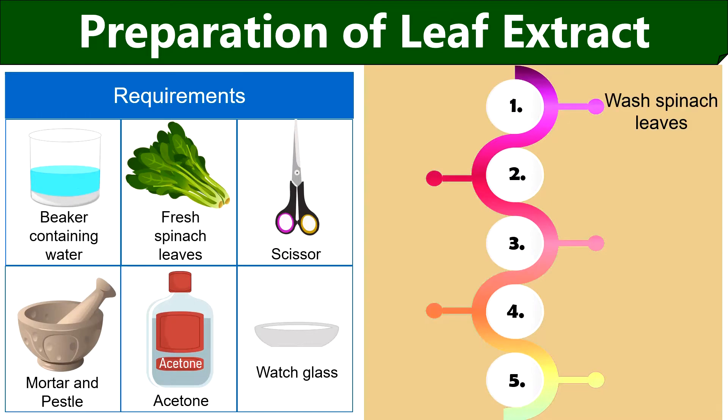To prepare the leaf extract, first wash the spinach leaves in the beaker containing water and after washing, take out the spinach leaves and allow the moisture to dry out.